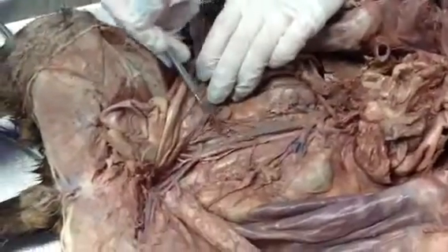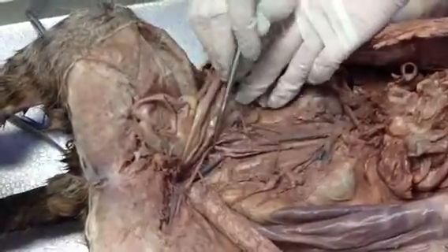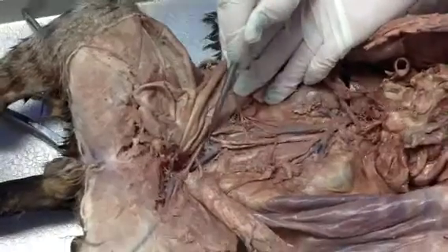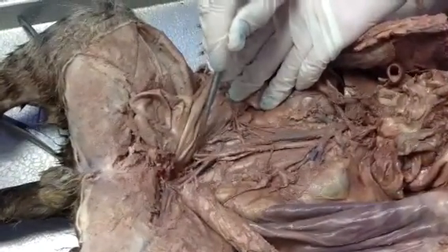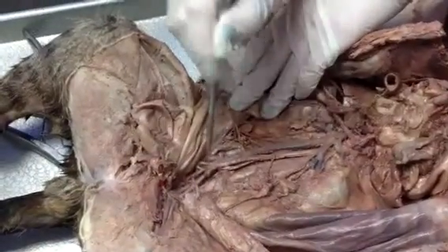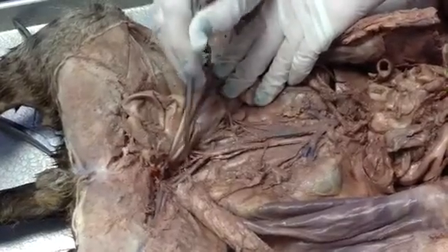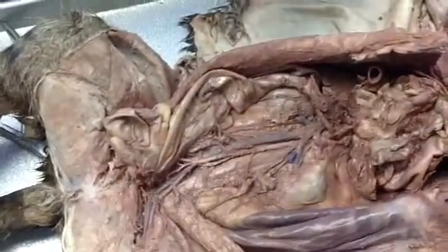Next one that goes off here and here, that's the renal vein. Let's go further down. And then here, hopefully, you can see that we have a branching. Okay, so here's one branch, and here's another branch of the inferior vena cava. These are called the common iliac veins. Now I have to dig.